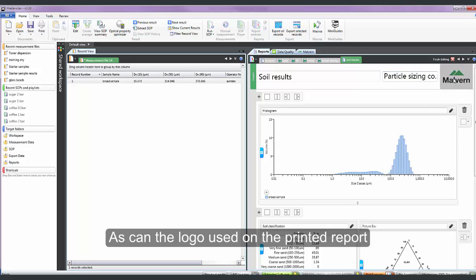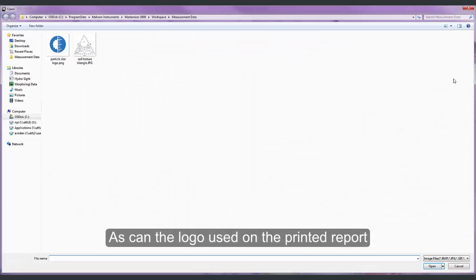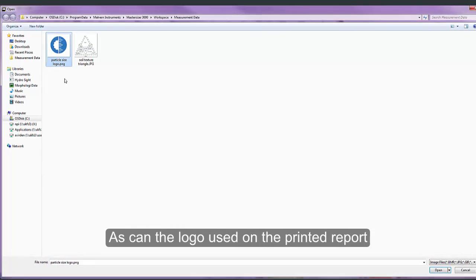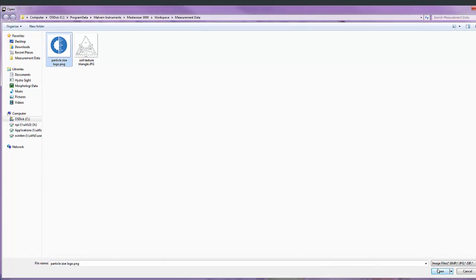I can also change the logo that will be used in the top right hand corner of the report when it is printed out.